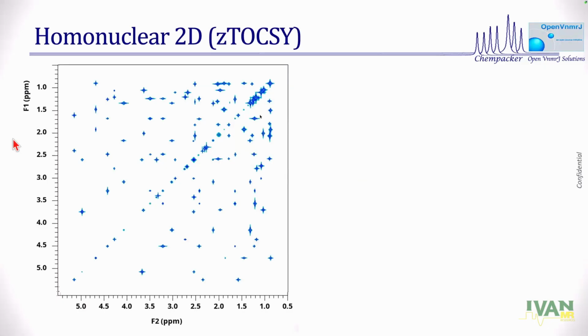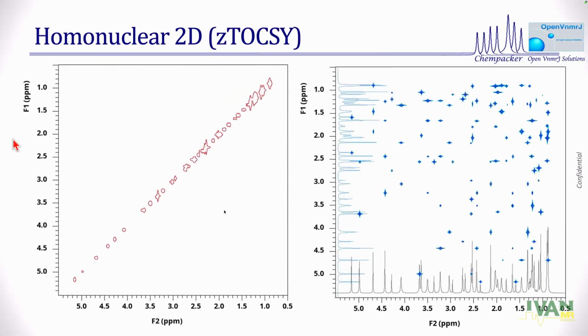You can simply go to the diagonal 2D table and put only 20% of that amplitude in the final 2D. So this is diagonal attenuated by 80%. You have the benefit of having the diagonal as a reference in your analysis, while it is not very big, annoying you. That becomes very important in noisy experiments as well.